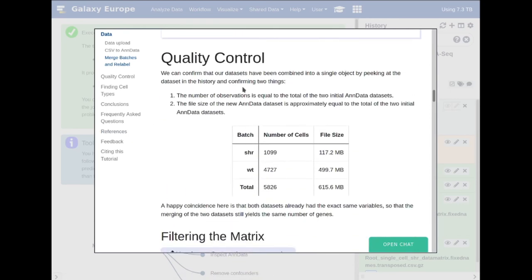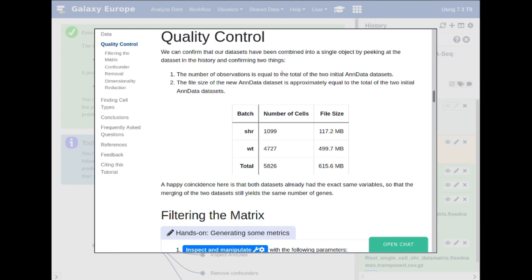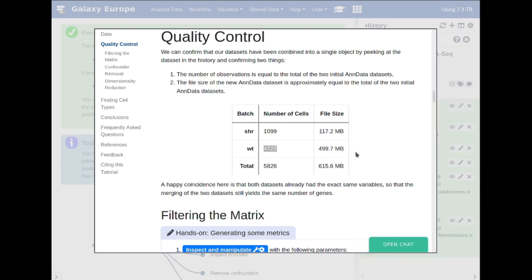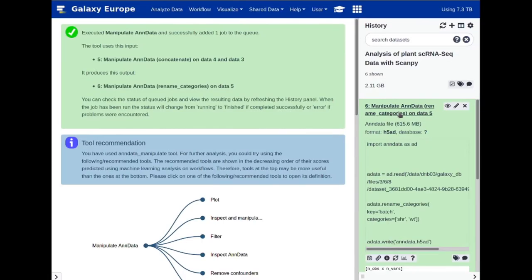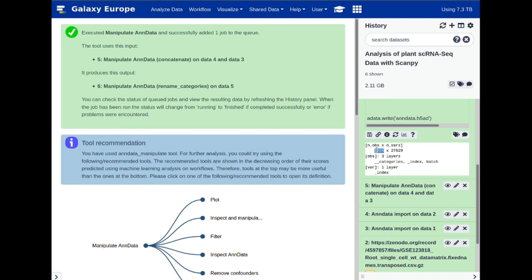We can confirm that our datasets have combined by looking at the new AnnData object. The general file size should be at least the sum of the SHR and WT individual datasets, and the number of cells should also be that sum. Looking at this new dataset, we see 5,826 observations. We have this new batch layer telling us specifically which original batch a given cell comes from — roughly 1,100 come from the SHR batch and 4,000 from the wild type.